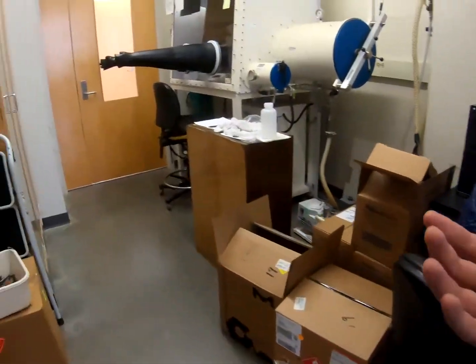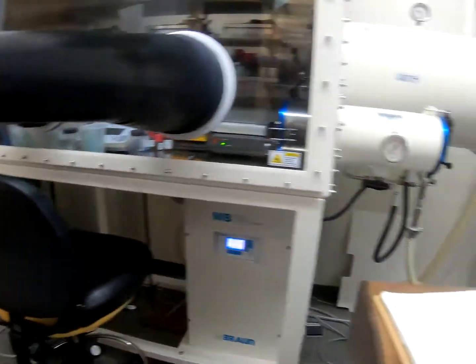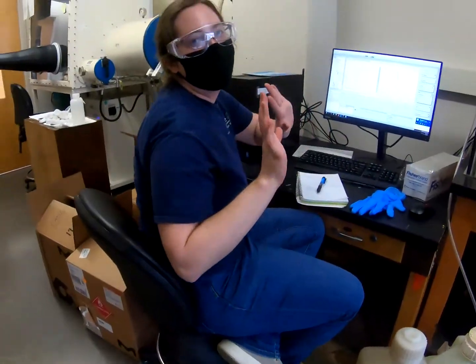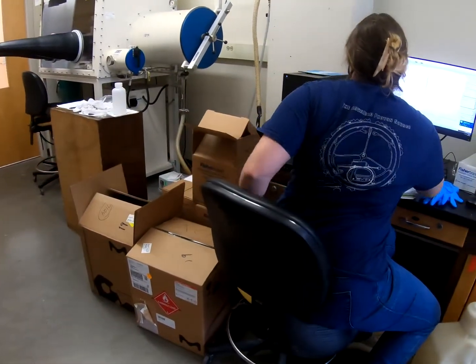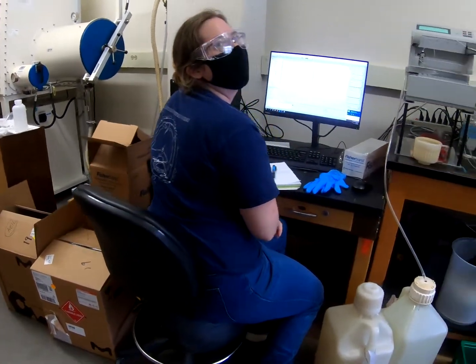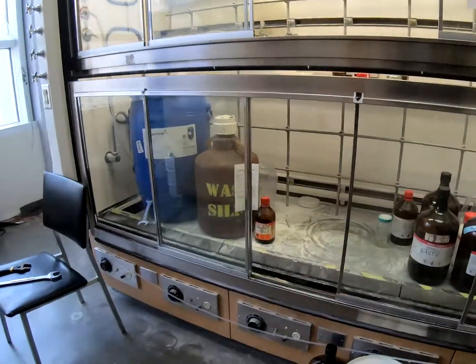In the back corner over here, we've got our glove box, which we use for compounds that are more air sensitive. And actually, I'm wearing a very dorky shirt right now because it's my argon shirt. So you can see there's a map of the synchrotron on the back. Crystallography team represent.